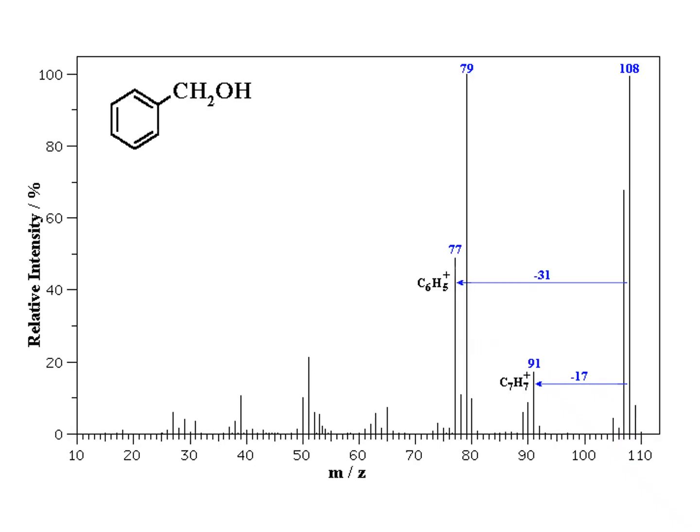Here we have our structure that will have a benzene ring. And when we look at our molecular ion cluster, we see the mass of 108 being the mass of this compound. And we have an M+1 peak at 109. When we fragment, the most obvious fragment is at 79. We also have one at 77. So if we consider the fragment at 77 characteristic of our benzene rings, we see that that is most likely owing to that C6H5 fragment.